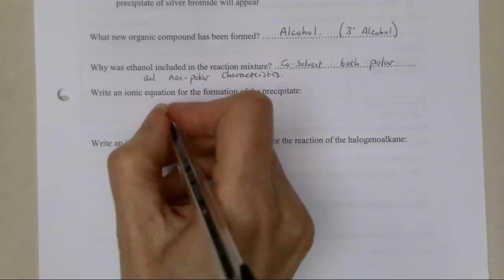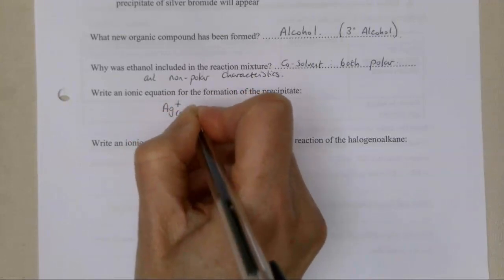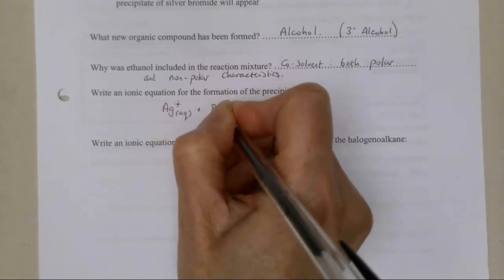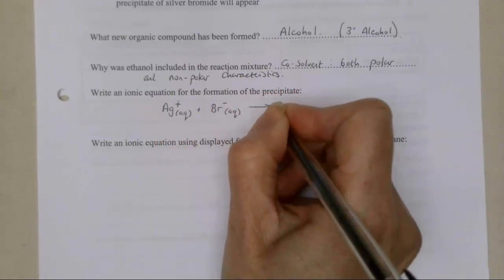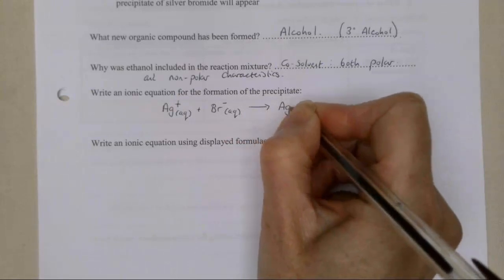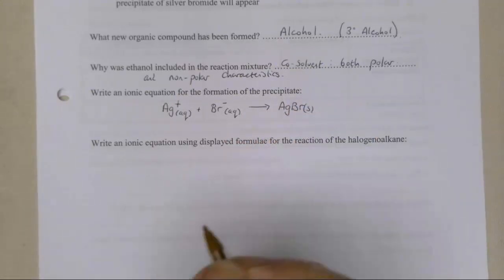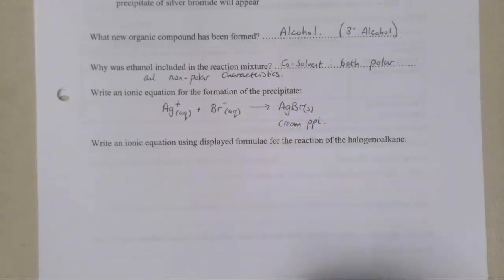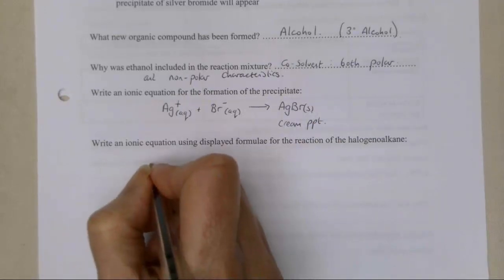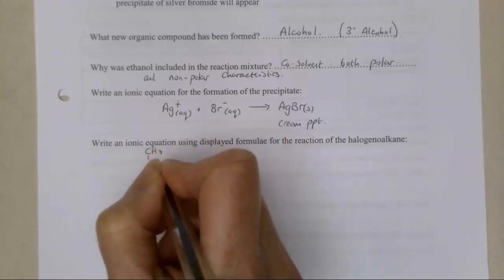The precipitate is very simple. We've got some silver ions, that's from the silver nitrate, and I've added bromide ions because remember they've come loose, they've been substituted for by the OH group, and that makes the silver bromide precipitate, and that's the cream precipitate that you see.